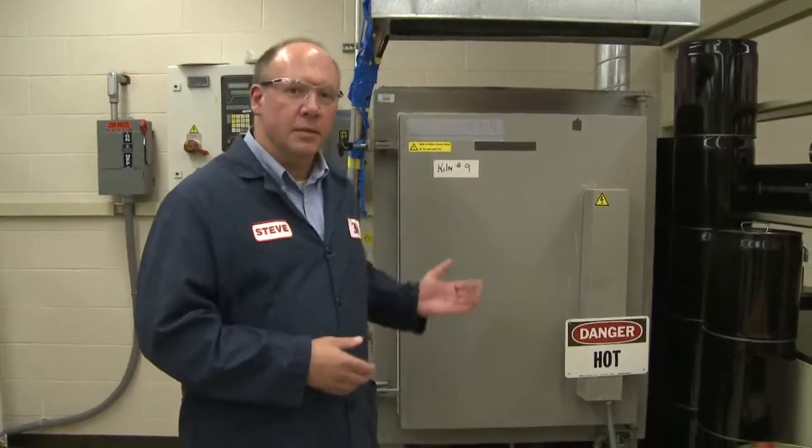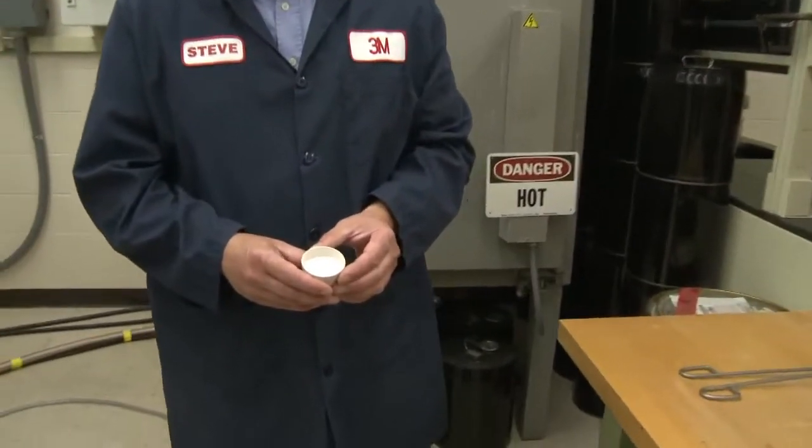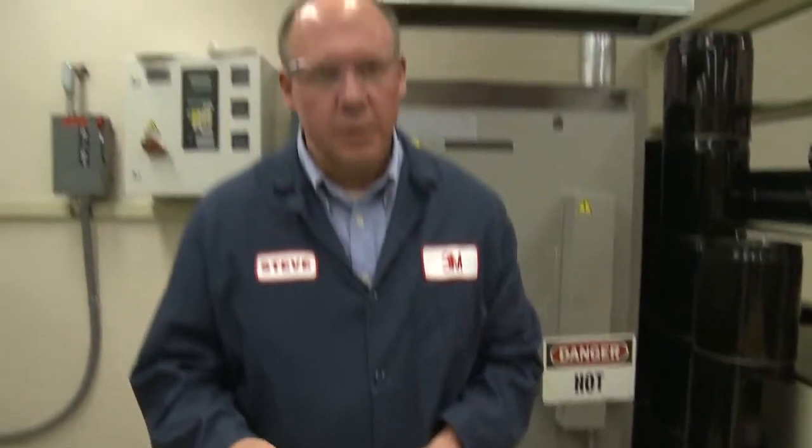We would take the material out of the kiln — that material would be a white powder, or an ash powder such as this. We would take this material and measure density, but we can also put it on a slide and put it into an SEM microscope, a scanning electron microscope, and look for bubble breakage.